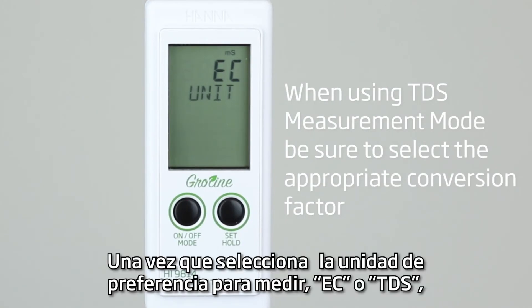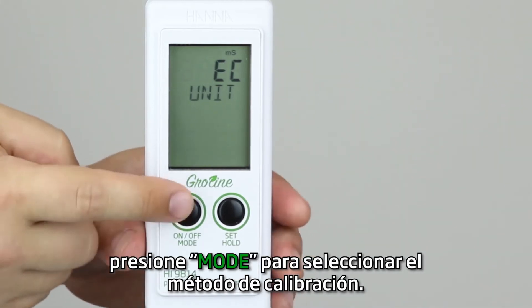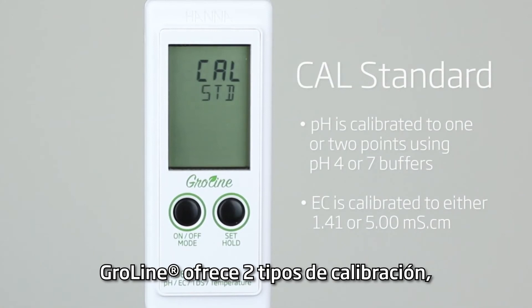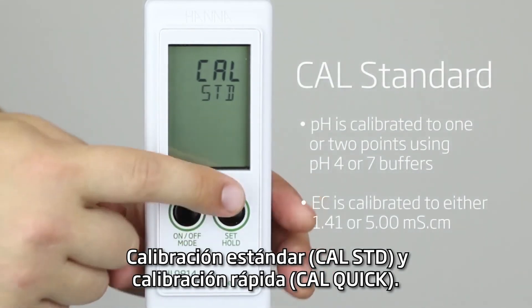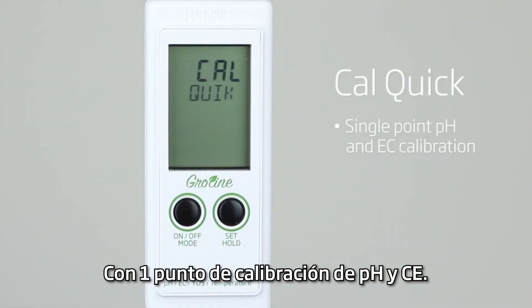Once you've selected your preferred measurement mode — EC or TDS — press mode again to choose your calibration type. GroLine offers two types of calibration: CAL standard and CAL quick. CAL quick is used with Hanna's quick calibration solution for a single point pH and EC calibration.